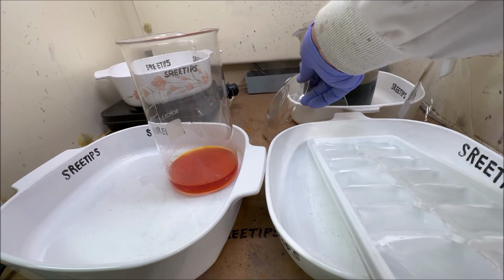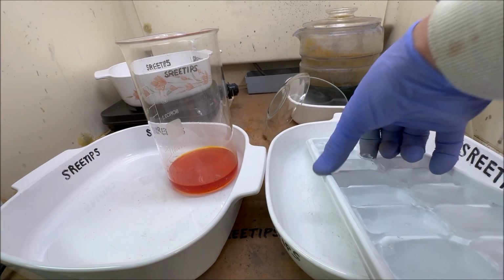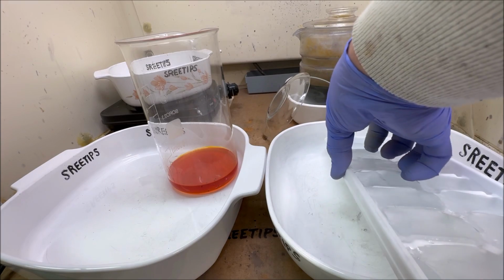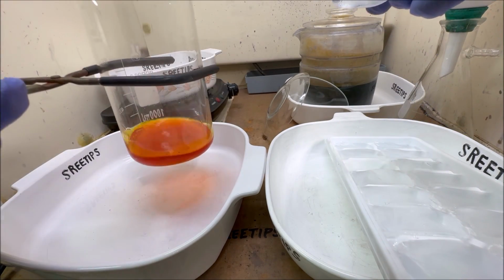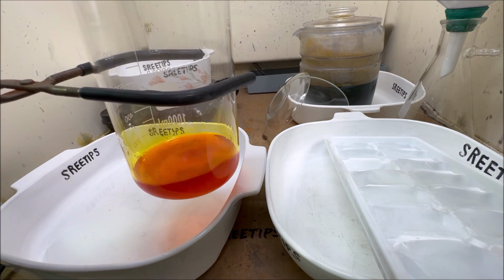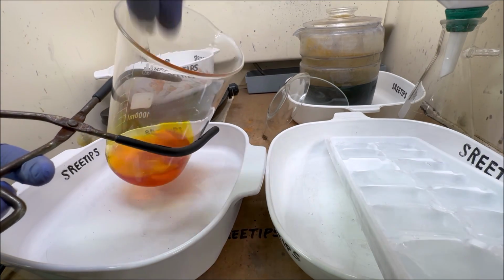So what we'll do now is try to get this cooled off so that we can filter it. That precipitate down on the bottom of there? Not sure what that is.